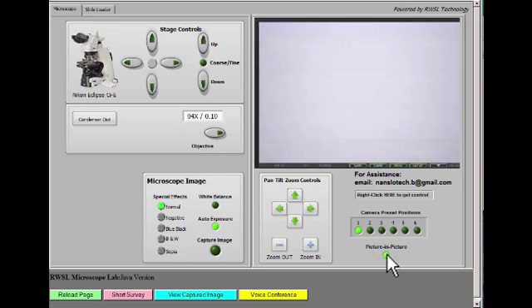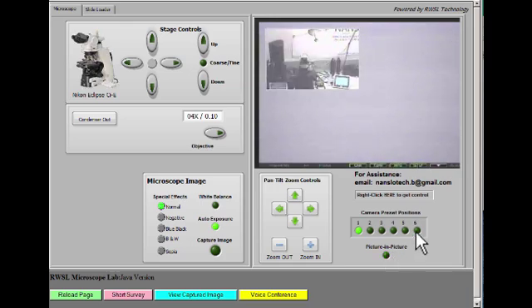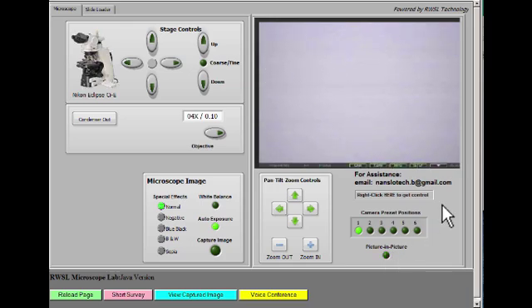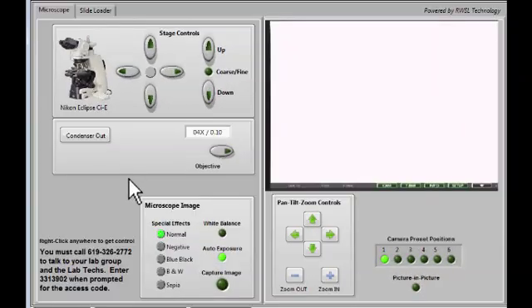If somebody else is in control at the time, you'll receive a message telling you that you've been placed in a queue. You can release control the same way by right-clicking and selecting the appropriate entry, and now somebody else can take control.